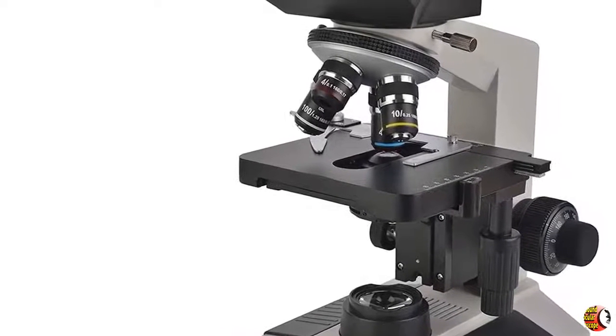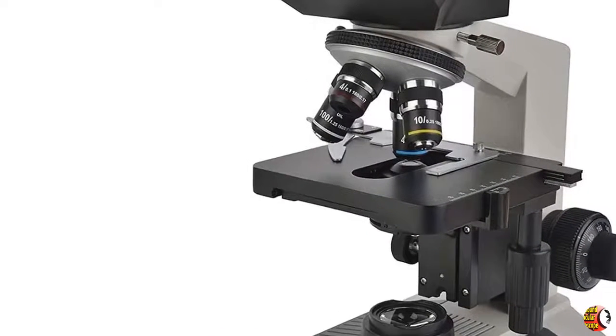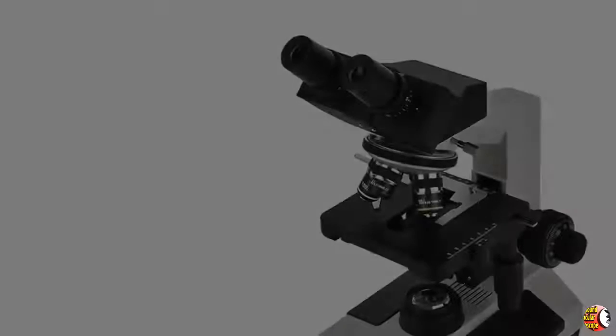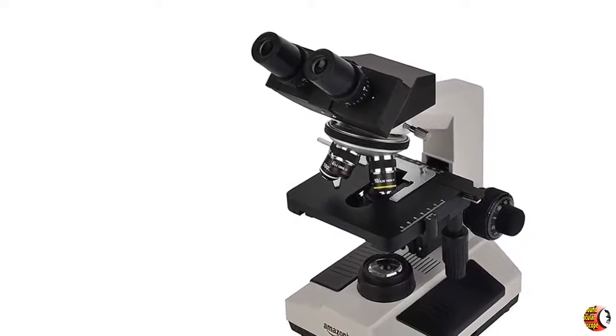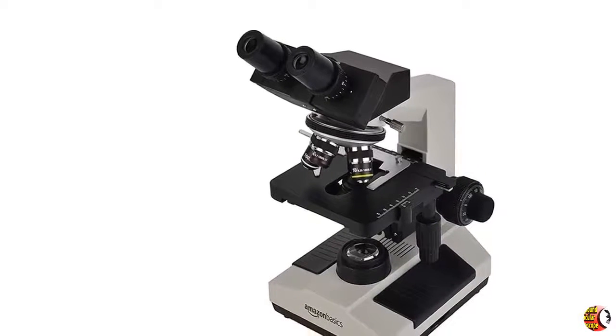Aluminum Design and Coated Glass Lenses. Built with a lightweight, compact aluminum metal frame, the Amazon Basics microscope offers durability and stability you can trust.